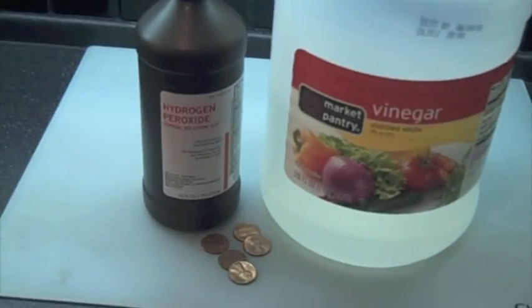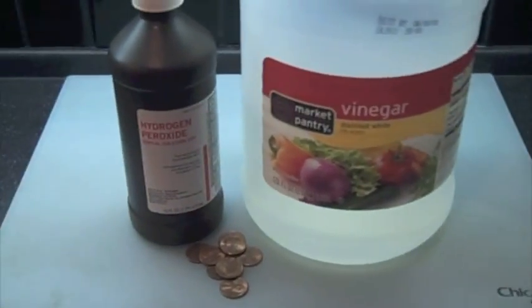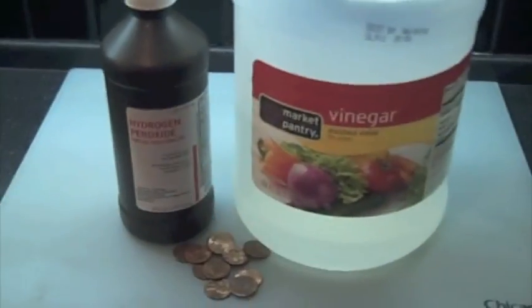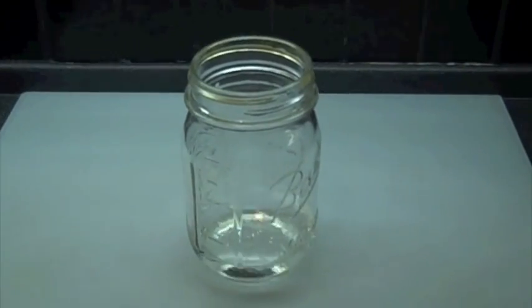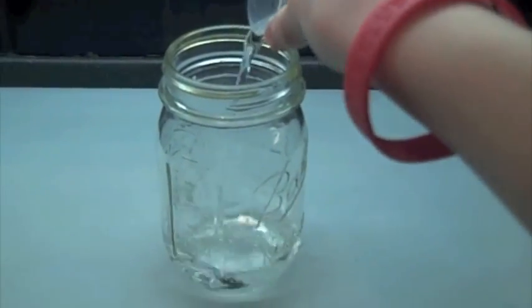And you'll also need pennies or any source of copper. First, in a glass container, measure out 30 milliliters of vinegar. Then add 15 milliliters of hydrogen peroxide.